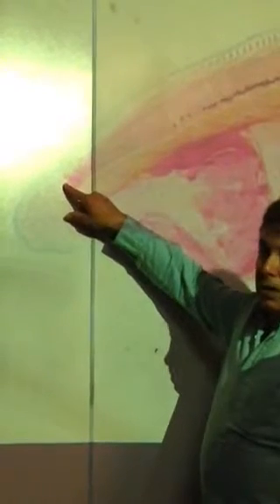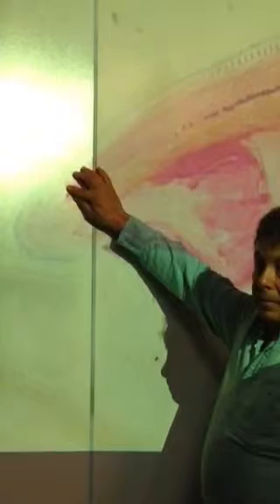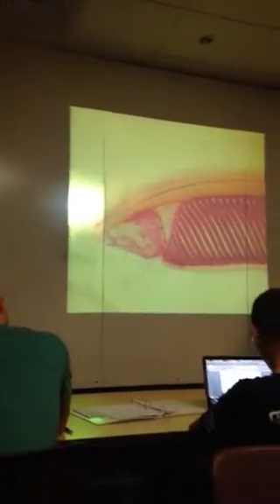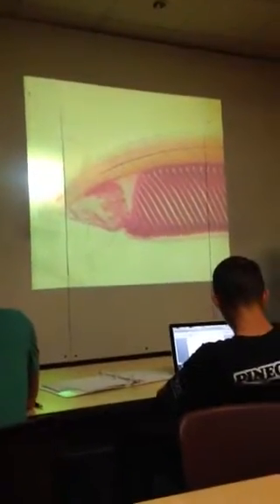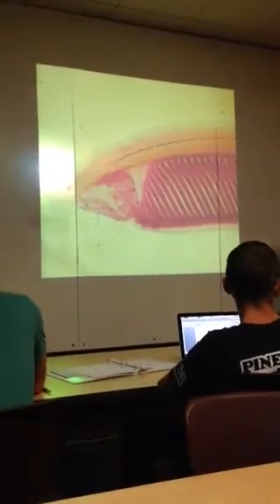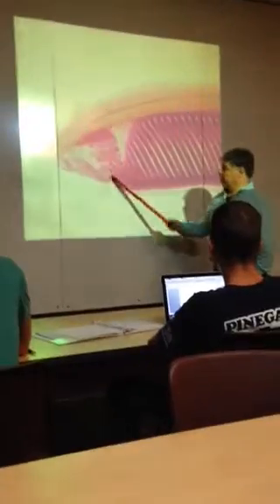pigment spot. And then sitting above it, this isn't as good. I wouldn't use this on the test because that's not as good as what I'd want. But if you know there's a pigment spot here, what's this little dark structure right there? I wouldn't use that on the test because I'd have a better picture for that. But this is how you have to know it. You have to look at it at this low mag and then go up to the high mag to see the details. What's this whole thing right here called, from here to here?